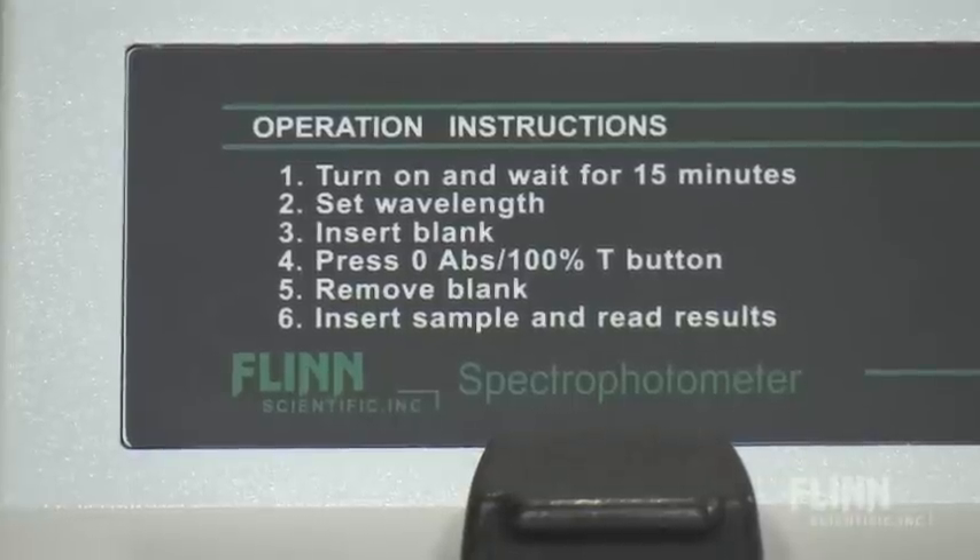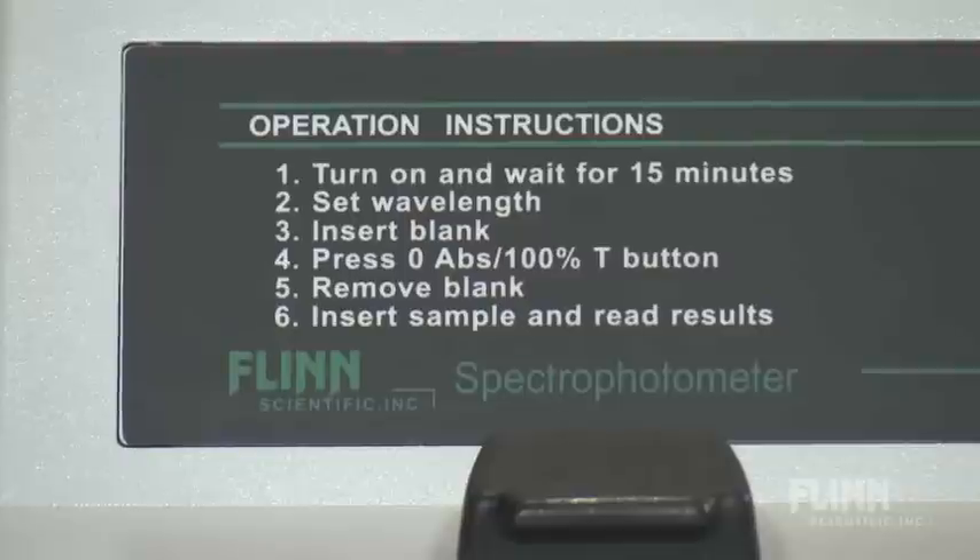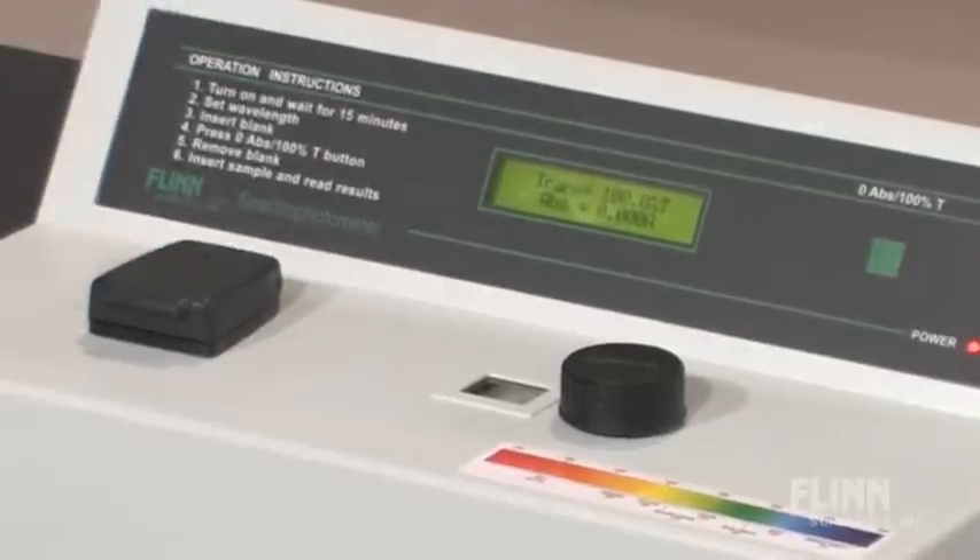While we're waiting, it is nice to have all the operation instructions right on the unit itself — they're printed right there. You can see we're set at 100% T, zero percent absorbance.